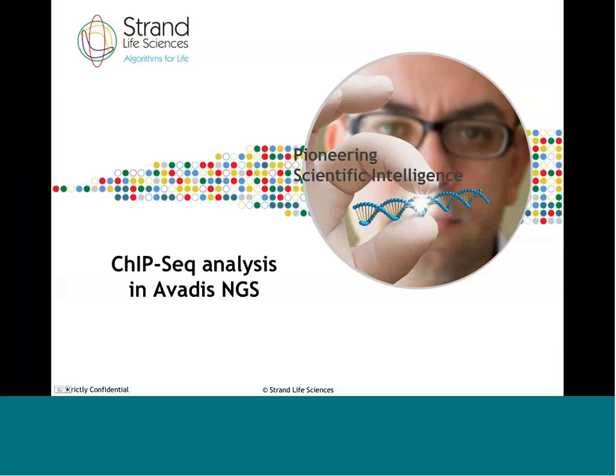My name is Vamsi. I'll be leading you through the ChIP-Seq features in Avadis NGS.